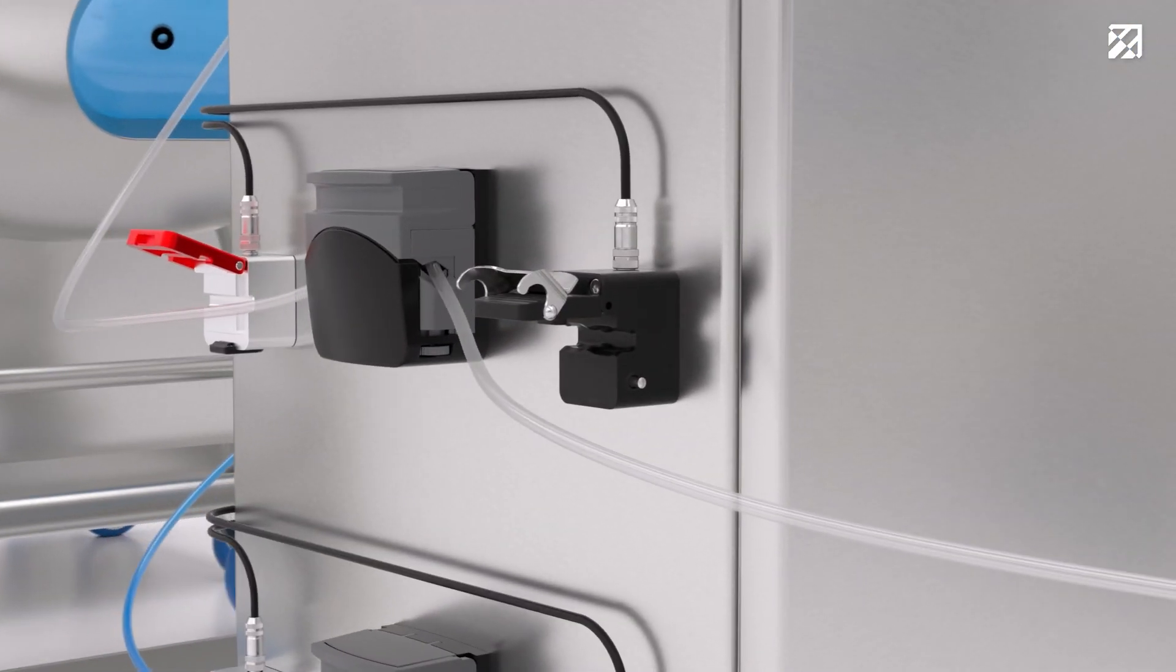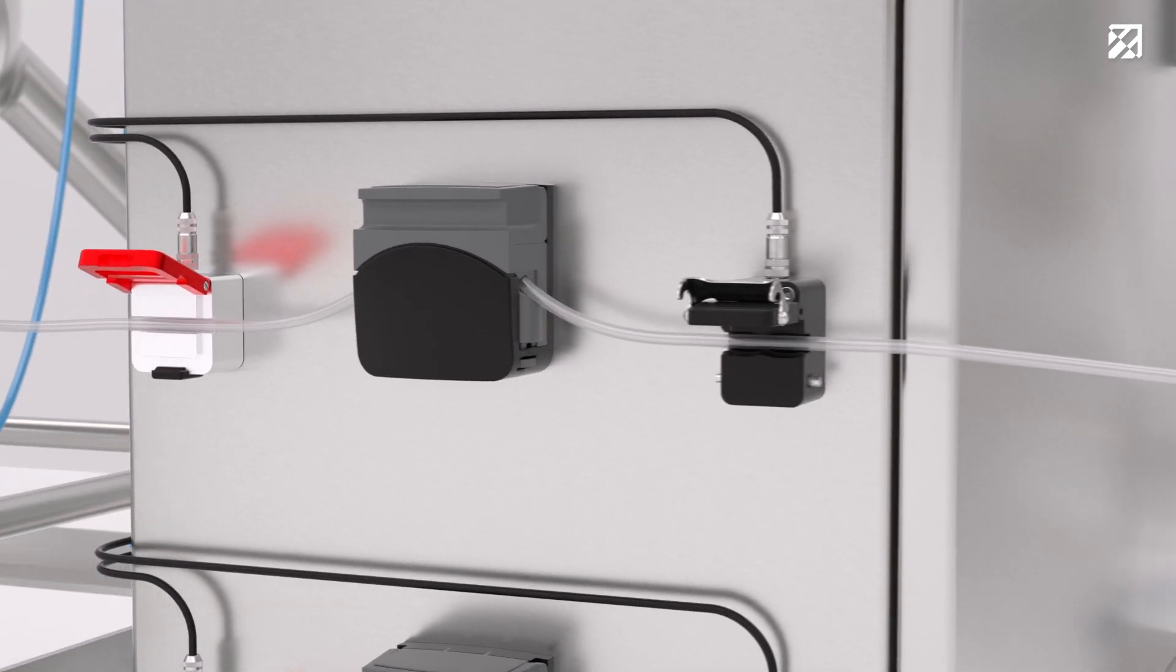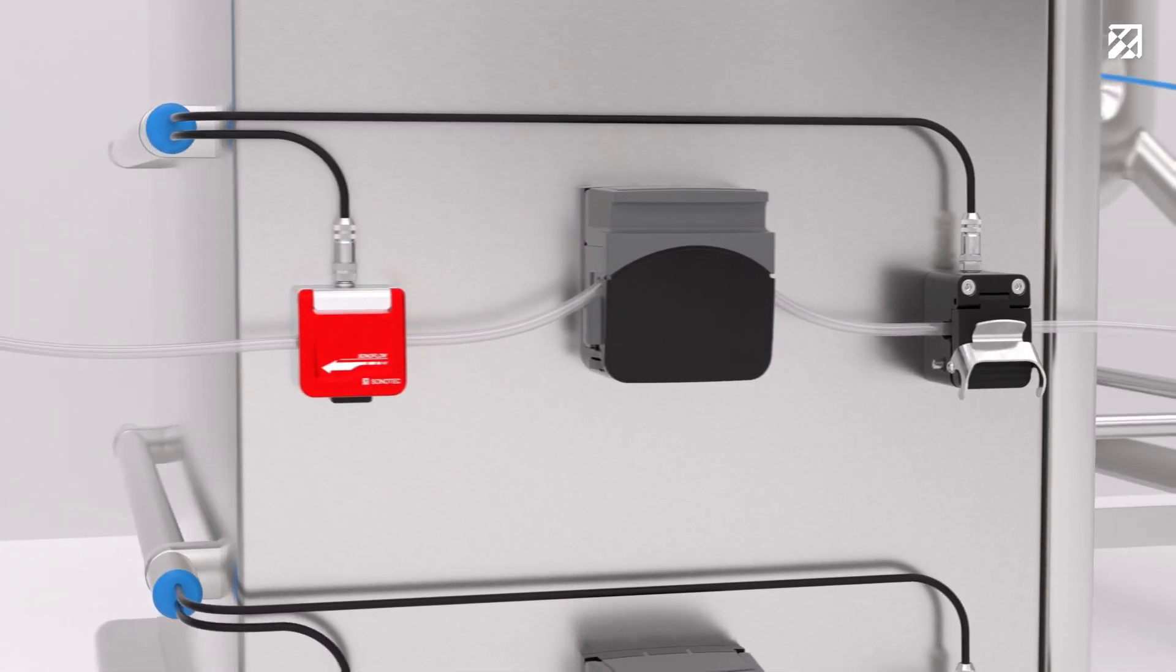There is no media contamination, no shear stress on cells, and you can conveniently replace tubing sets.